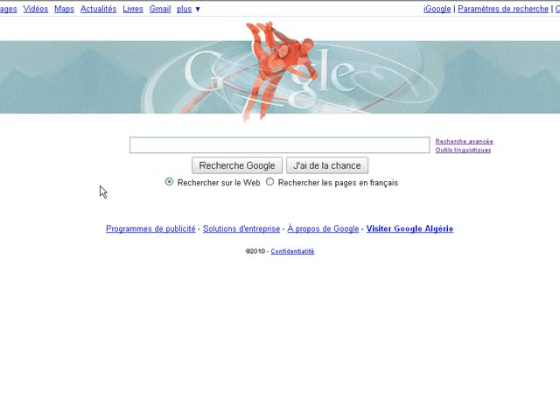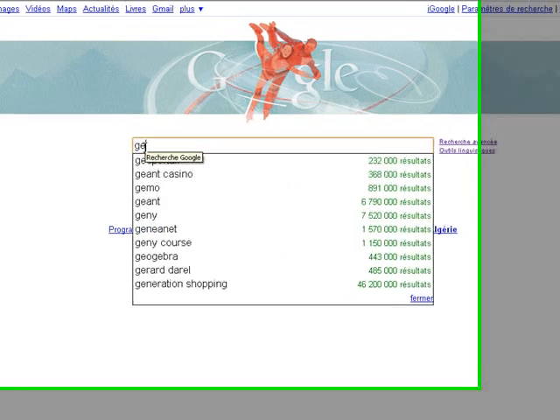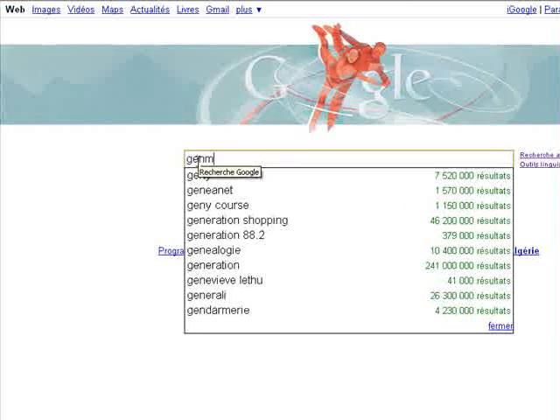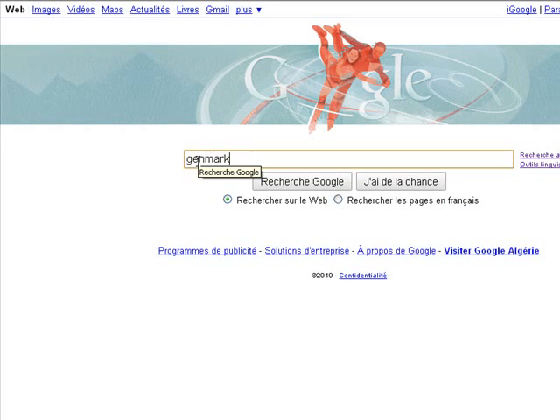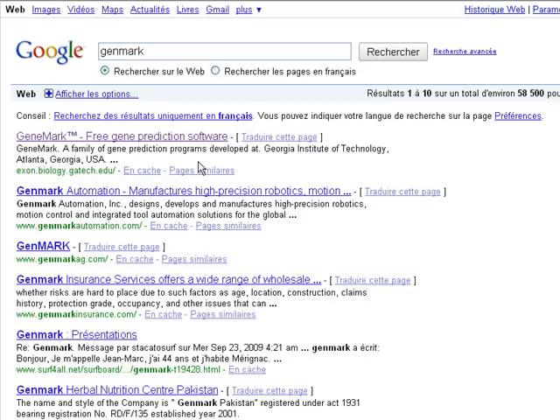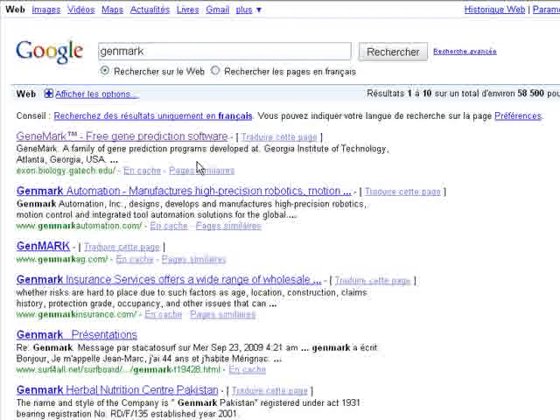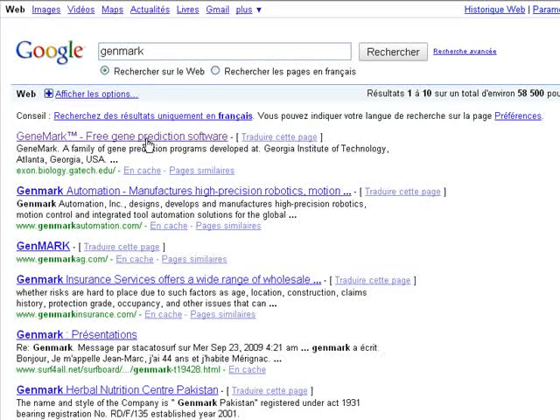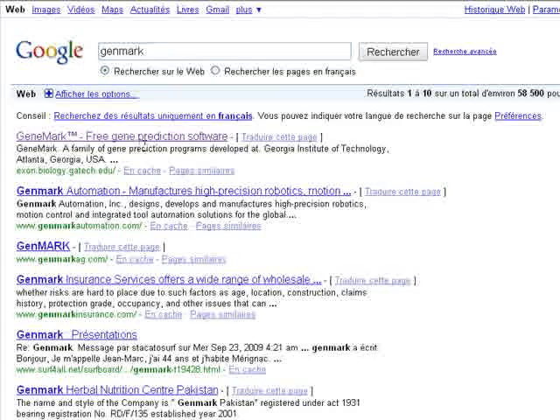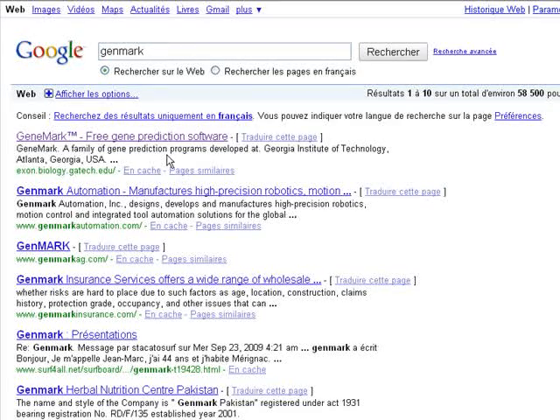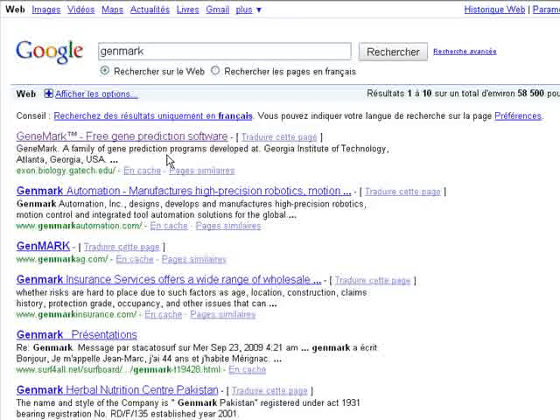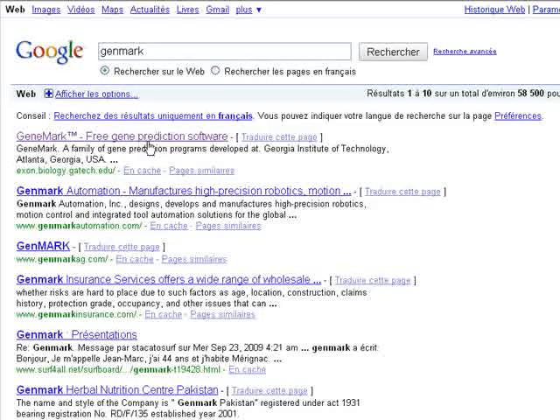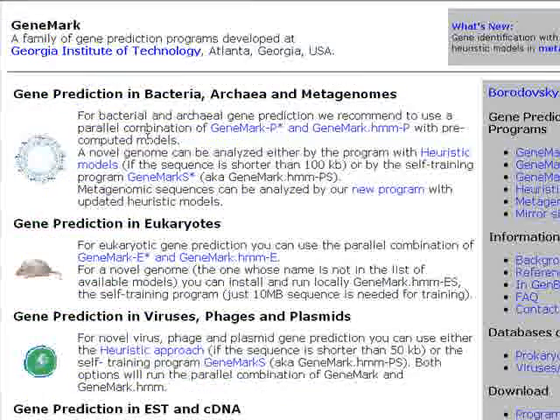The first thing to do is to go to Google as usual and we type our software name which is GeneMark. We hit enter. As we can see here on the first hit, GeneMark is a family of gene prediction programs developed at Georgia Institute of Technology Atlanta. We click on the first hit.